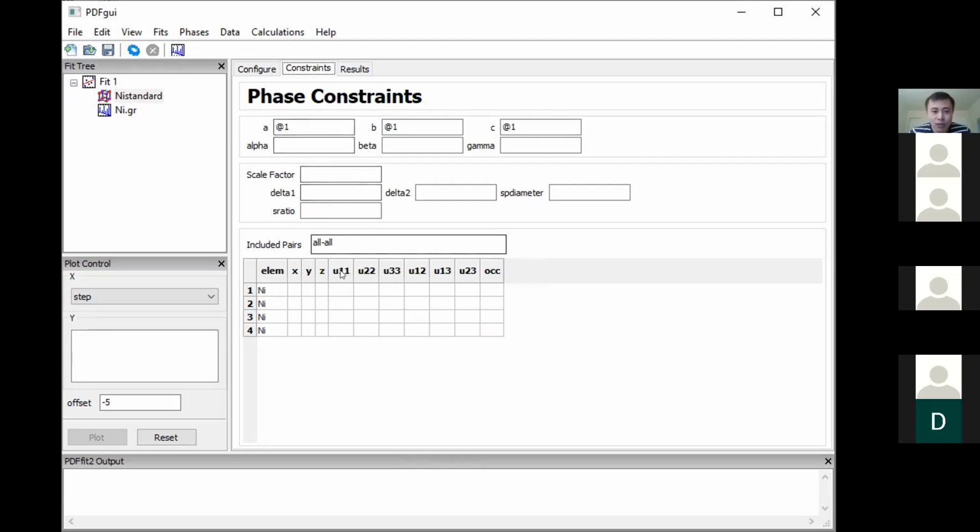So what I do is normally I just want to define, right? Two digits, same number, is what I personally reserve for their B value. And we do not have to care about this part. They are all special positions. But we need to look at this part, which we didn't touch upon previously.